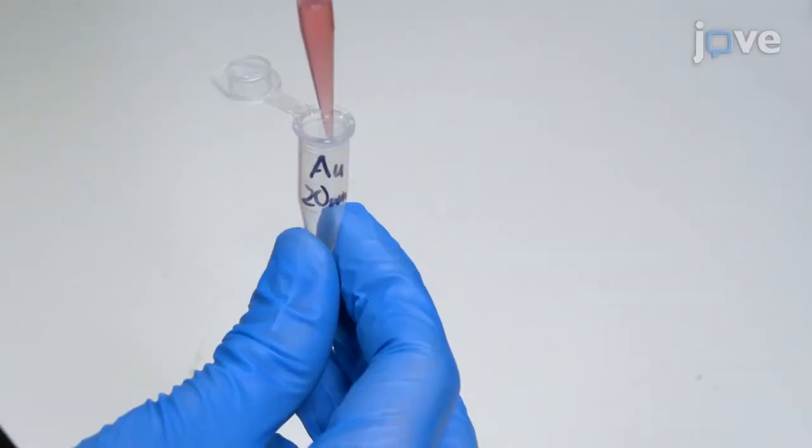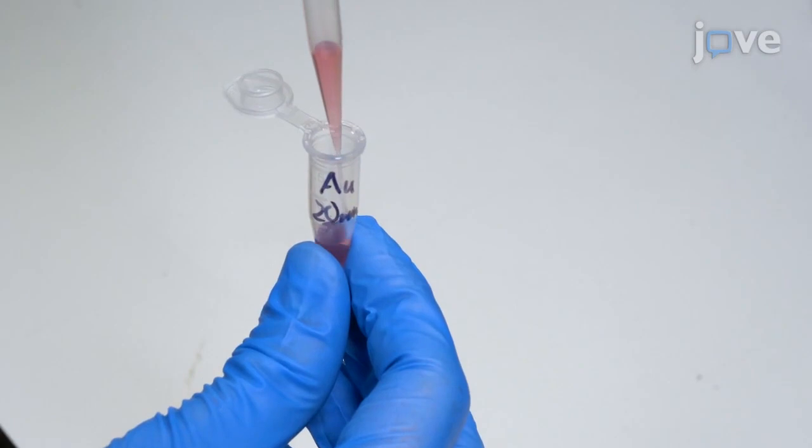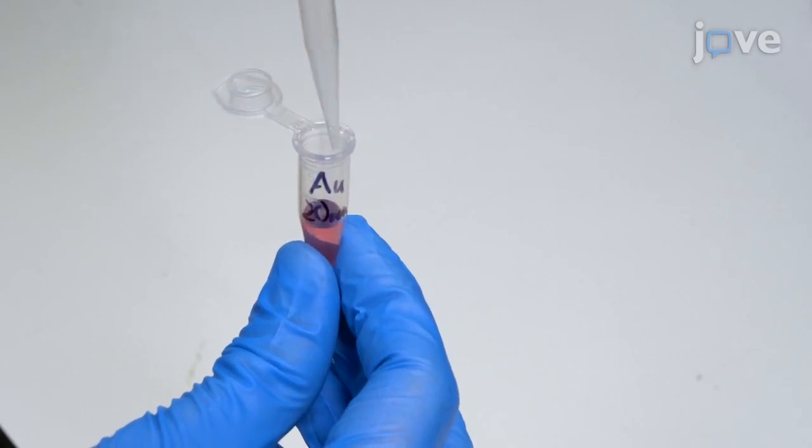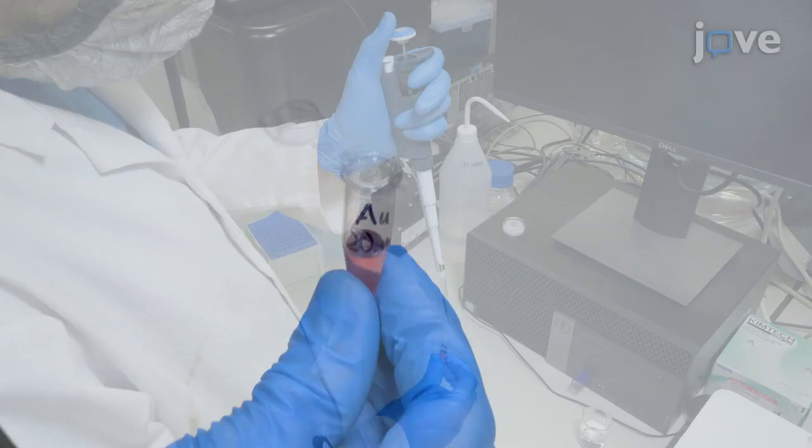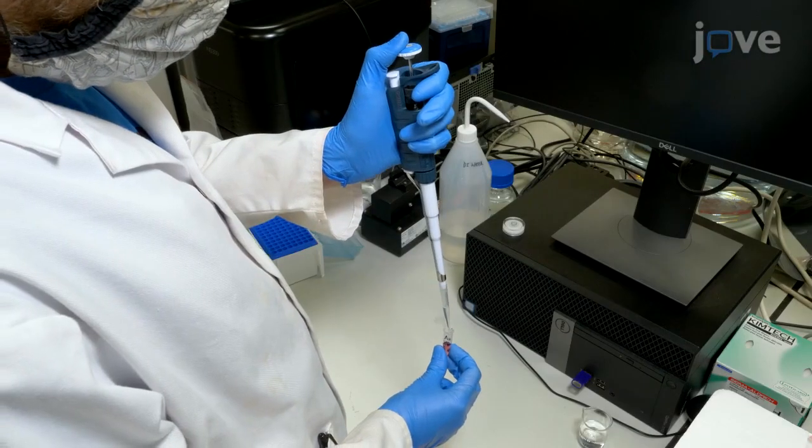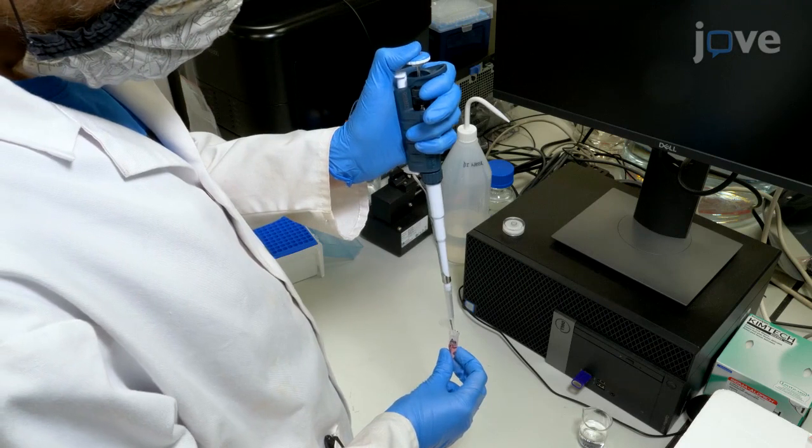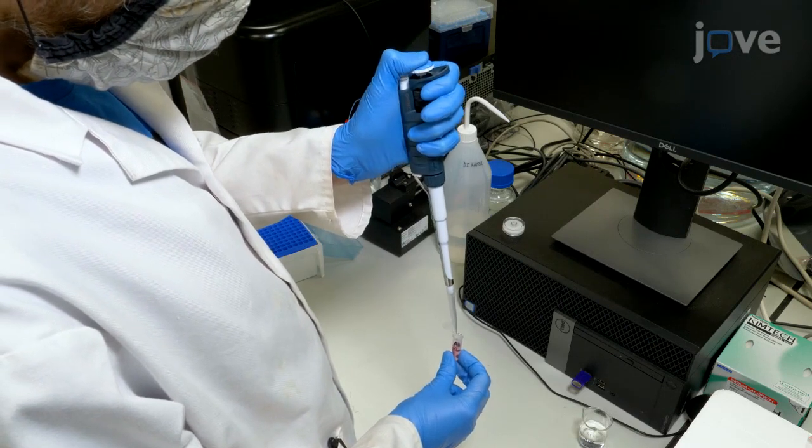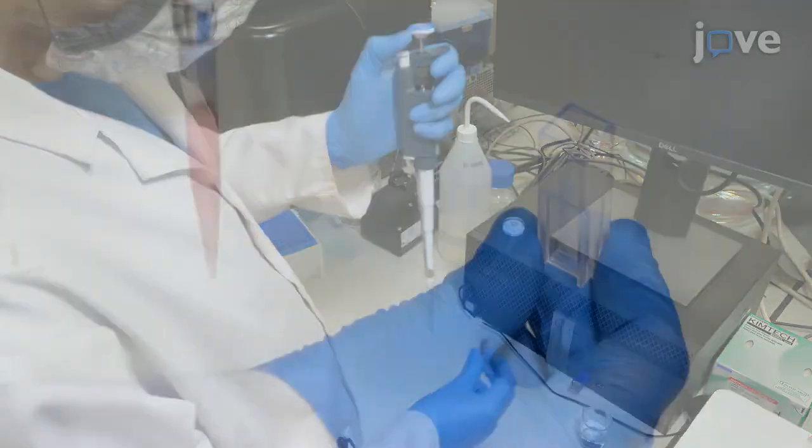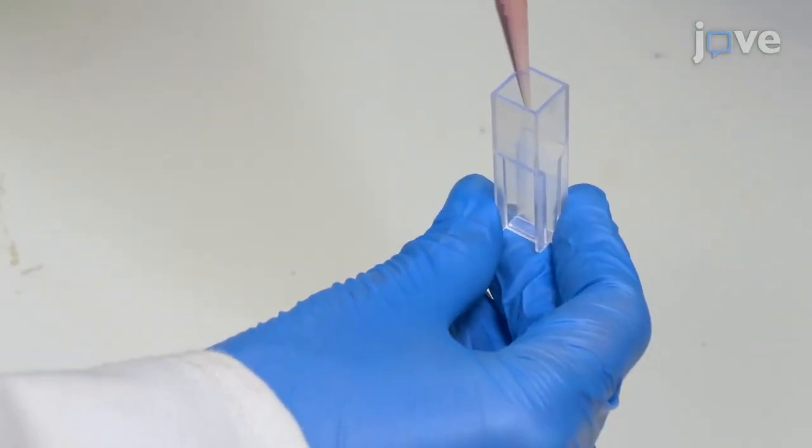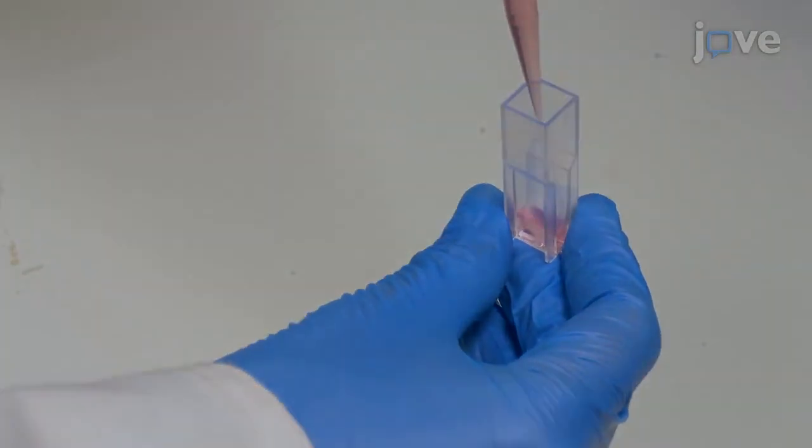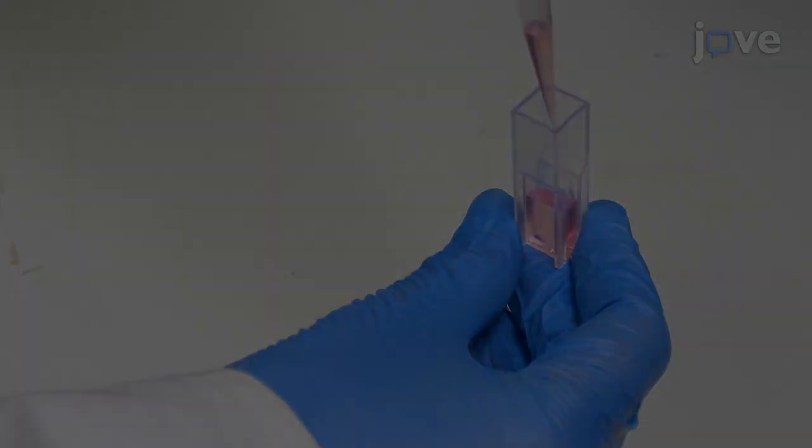Take a 500 µL subsample of each gold nanoparticle sample and prepare a dilution with 500 µL of ultra-pure water. Place the dilutions in 1 mL cuvettes with a final concentration of 25 µg per mL.